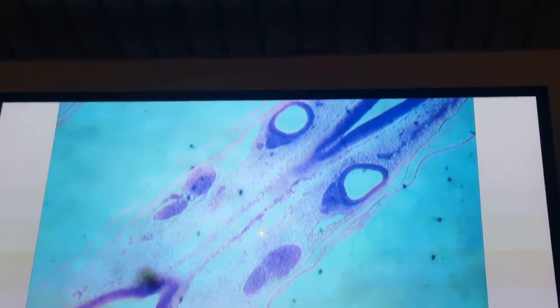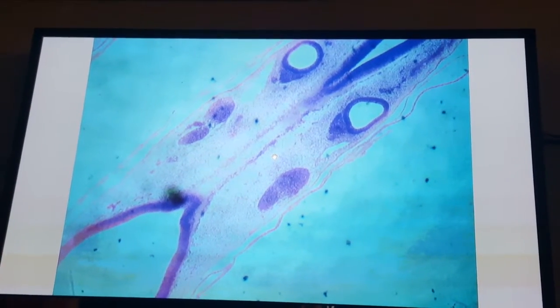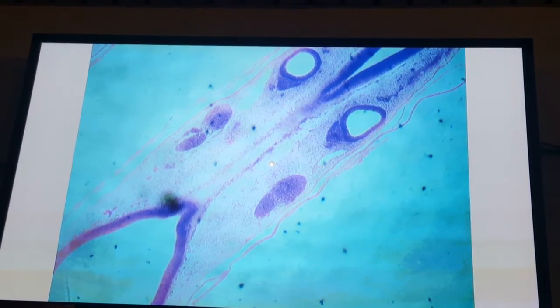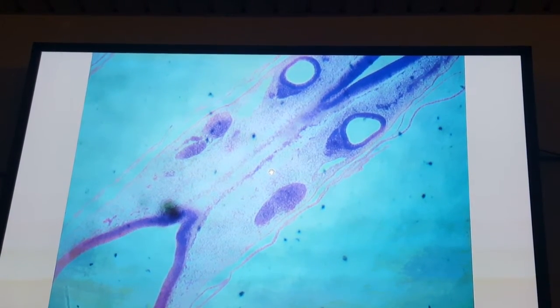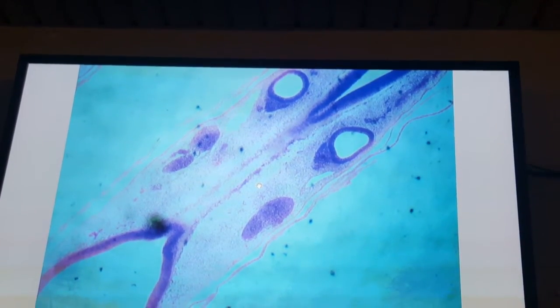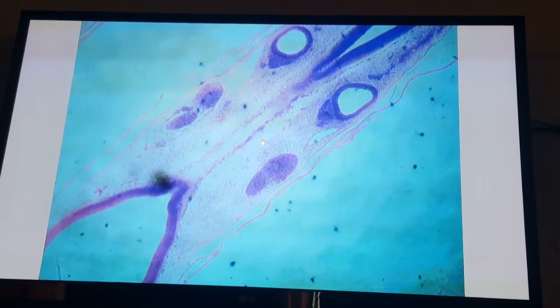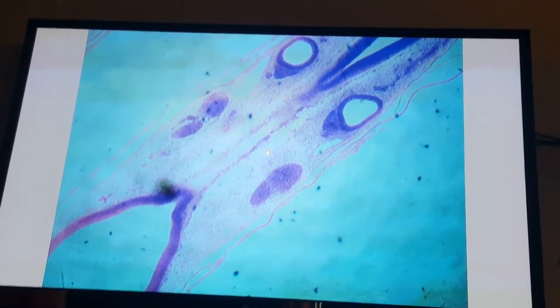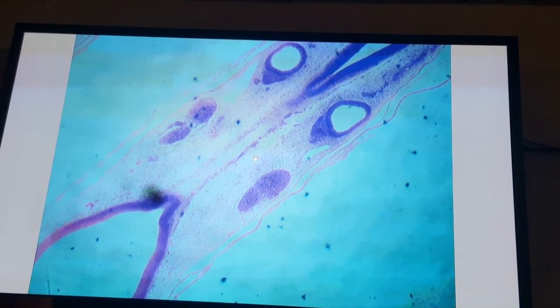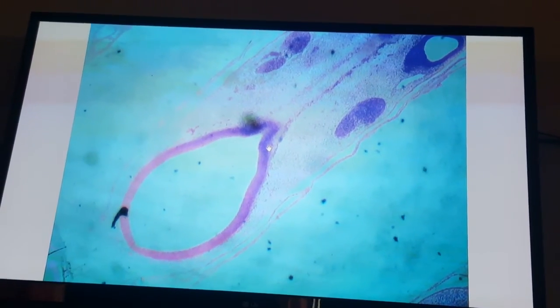A transverse section in chick embryo, mature status beyond organogenesis. You know, the transverse sections starting from cephalic parts of the embryo will show the curvature of the folded cephalic part of the embryo. And because the transverse section will be in the C-shaped anterior part of the folded embryo, we will have one limb of the U on one side.